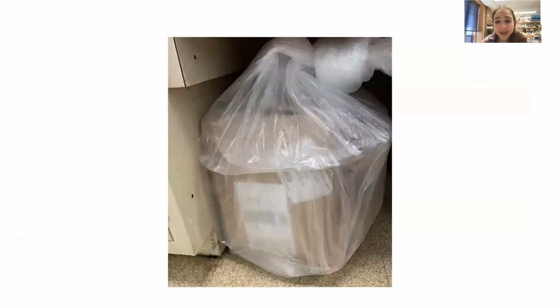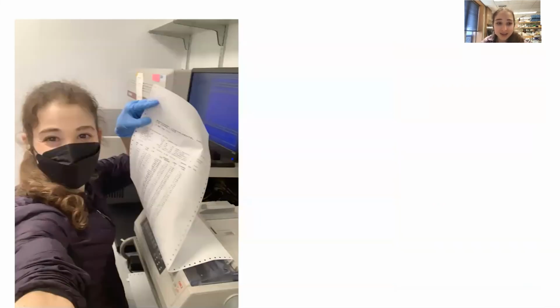The other part I really don't like is that our scintillation counter is across campus. The other day I had to walk through the snow, but the happy results made it worth it, because my kinase that I just purified is nice and active and happy. So that was good. I put all my samples into this box, carrying my little Santa sack, as my colleague calls it, across the campus to the scintillation counter.